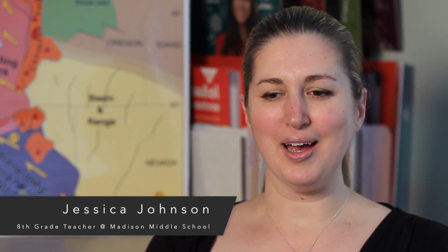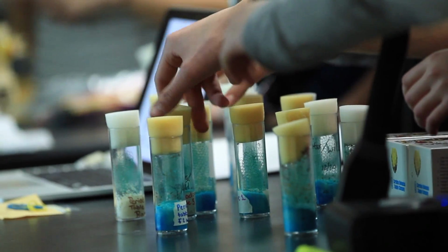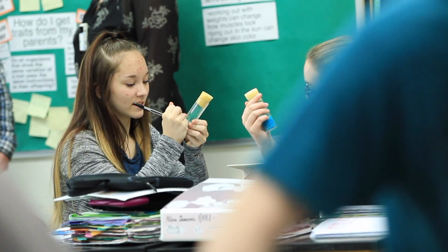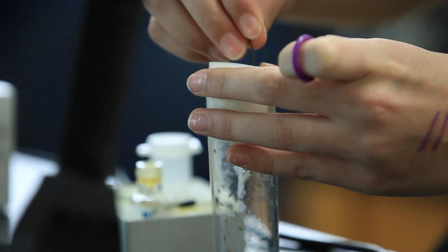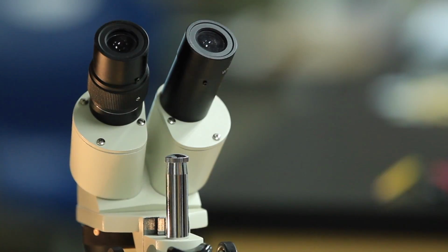The Fruit Fly project is meant to accompany a genetics unit. And so my students have been learning about how traits are passed from parents to offspring to the next generation. And the fruit flies are a really good way to allow students to see multiple generations of actual living organisms as they pass their traits from one parent generation to the corresponding F1 and F2 generations.